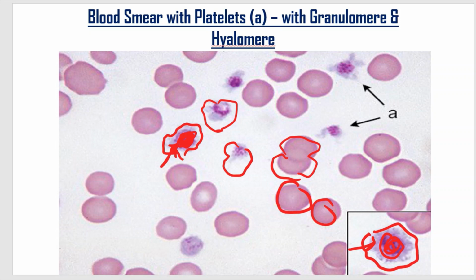So those are the cells that we are drawing under the blood smear. Draw all those cells at high power, and each cell has to have its own diagram. So you draw about 8 diagrams on the blood smear: the red blood cells, the neutrophils, the eosinophils, the basophils, the platelets, the monocytes, and the lymphocytes. About 7 to 8 diagrams just on the blood smear.